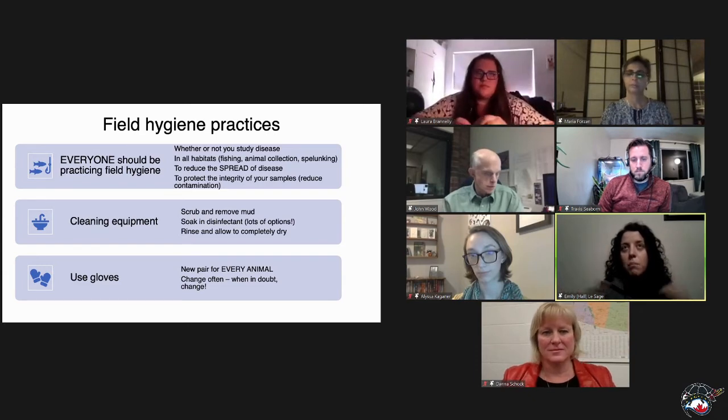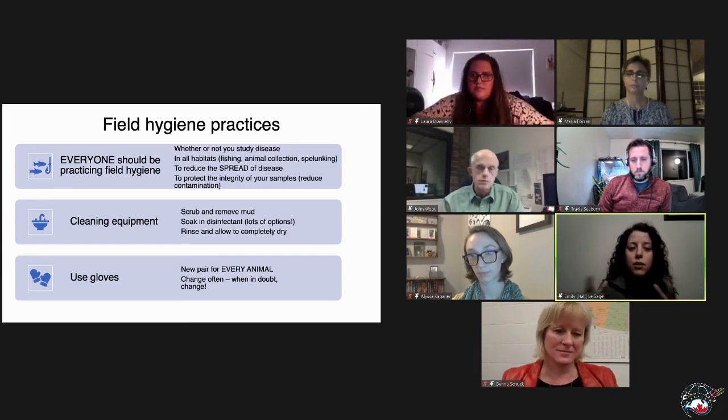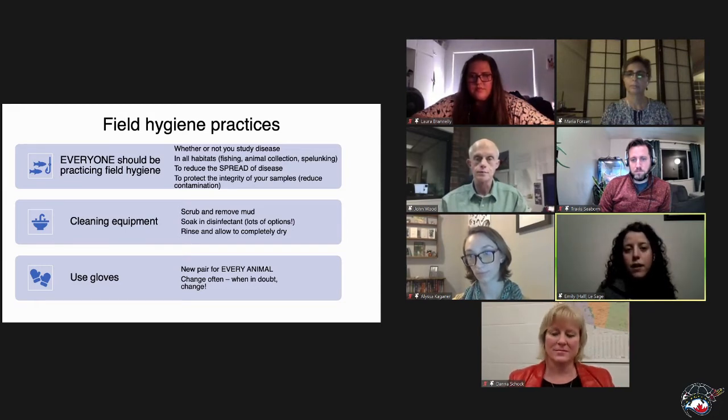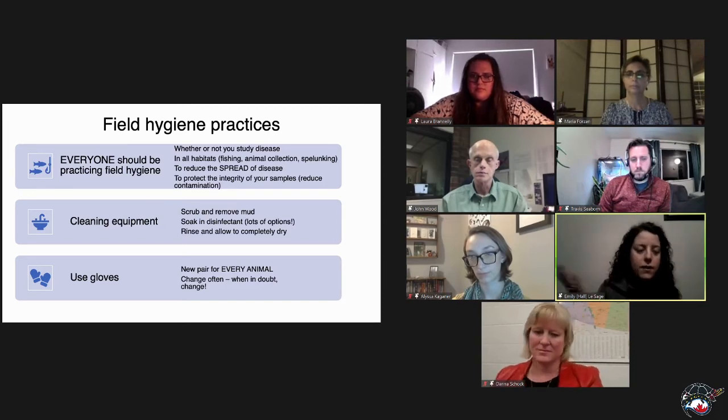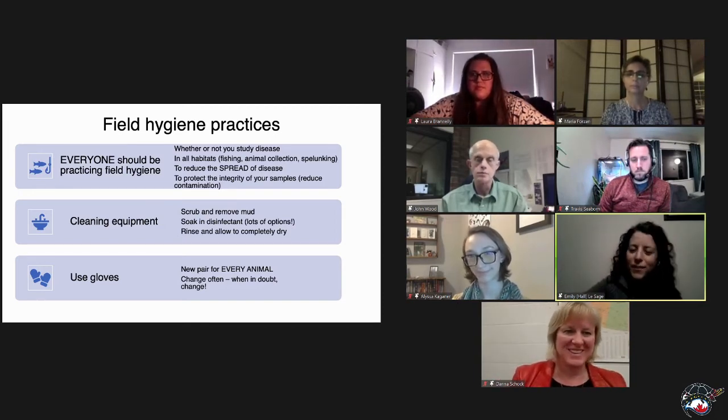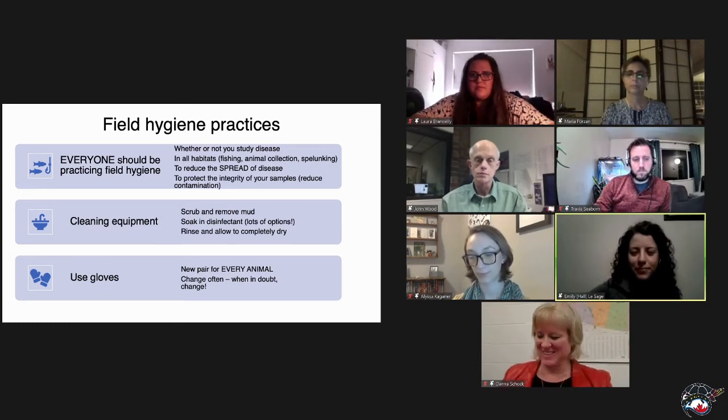test for inhibition. Like we said, you can take that pond water into the lab, like Laura Brannelly did. You add some of the target DNA to the pond water in the lab and actually look at how efficient your extraction and qPCR assays are at detecting that target DNA, because you know how much you added. So you should be able to do the math and figure out how much you find in your qPCR assay.